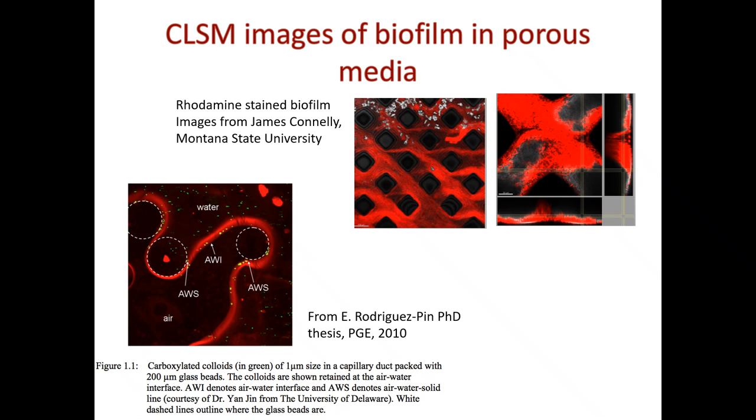And that was sort of an open question that was left open, because at the time in 2010, you couldn't assemble three dimensional images from one model. That is possible today. So something to think about. So again, when you have things fluorescing, they're going to fluoresce. So it's very hard to tell whether all of these points are just in the water phase in the middle of a phase, or are they stuck on some interface, for instance, some water-solid interface, and then they look a little remote compared to these. That's what we don't know. But those are the questions we want to ask.